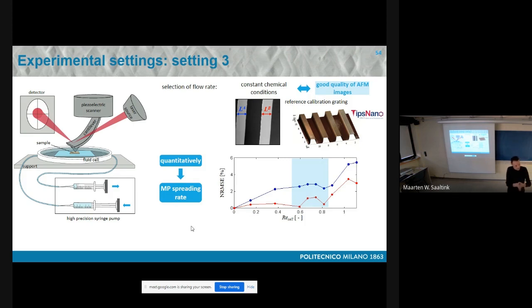Another thing that we started doing, but it's still ongoing, is that we are trying to relate the parameters of these distributions to the main parameters controlling kinetic Monte Carlo simulations, for example. If you use kinetic Monte Carlo, you see very similar patterns to this. And the point is, can I really find a link between parameters that you use in kinetic Monte Carlo and parameters that you use in this type of stochastic description? That's another area that we are exploring. So yes, I agree.